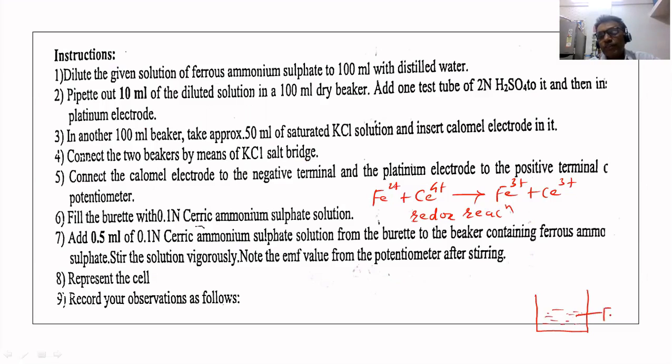So this is Fe2+ solution, and we are adding from the burette the ceric ammonium sulphate solution. Due to this, the reaction between these two will take place.